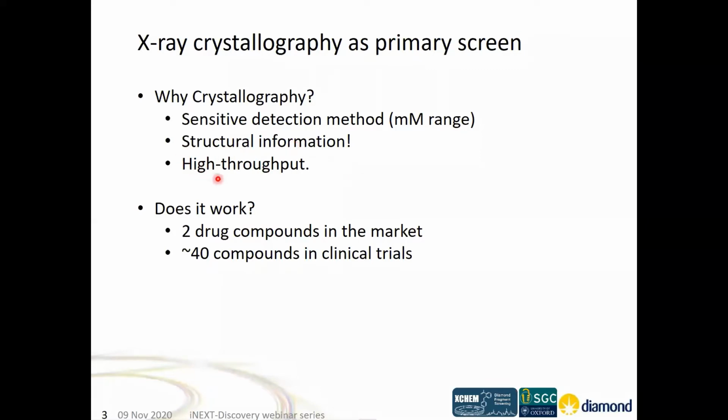Then recently, it could be done in X-ray crystallography because of the throughput of producing those data. Now synchrotrons can collect data in less than a few seconds. So data comes through very quickly, and the bottleneck was the sample preparation. You needed an infrastructure for people to be able to streamline that process. And that's what XChem has been put together for.